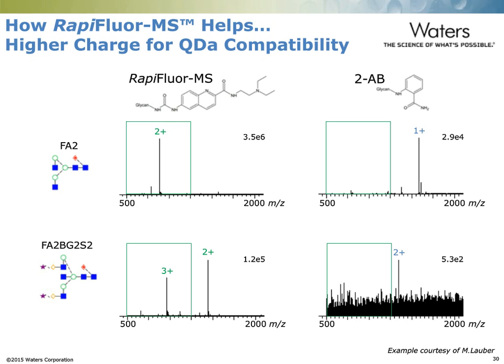And then if we look at the structure on the bottom, again, we see a dramatic improvement in MS response, and again, a corresponding increase in the populated charge states, where now we have a +3 charge state populated.